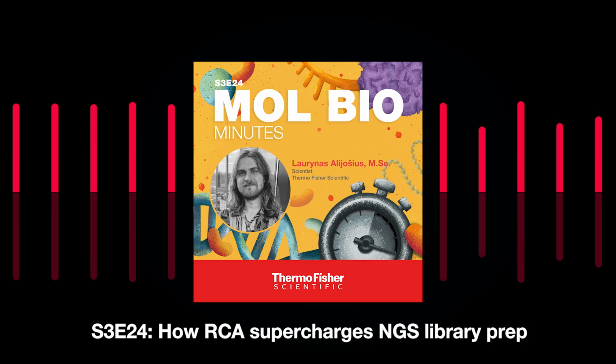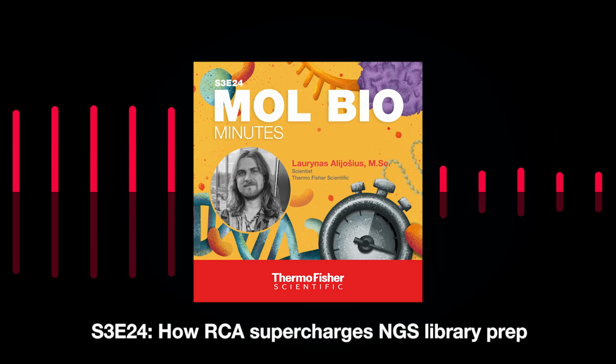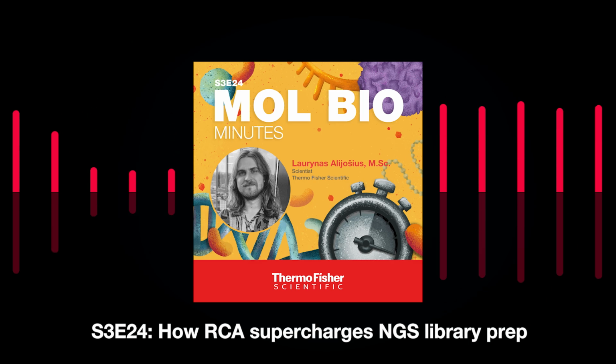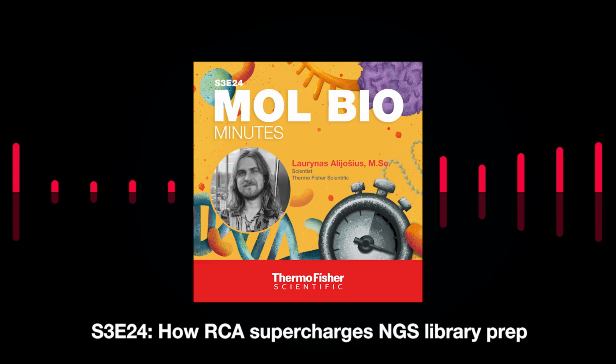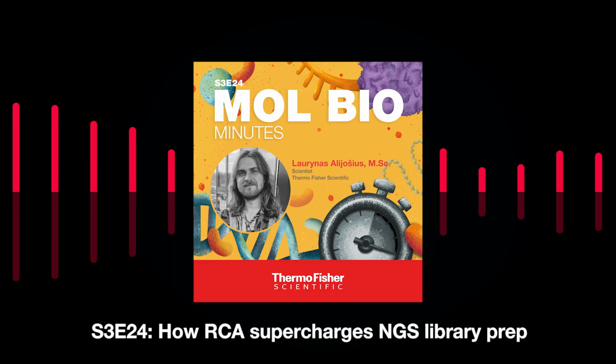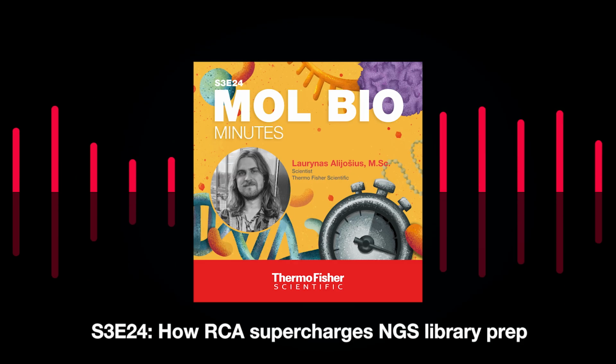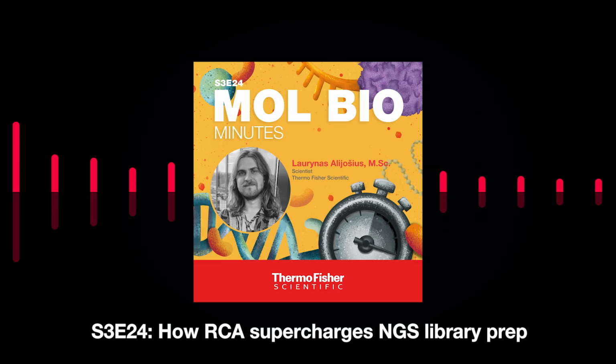What does this strand displacement mean? Then picture this. During the multiple displacement amplification reaction, the polymerase is like a bulldozer, pushing newly synthesized DNA strands out of the way to create super long strands of DNA. It does sound a bit confusing, right? So let's break it down step by step.